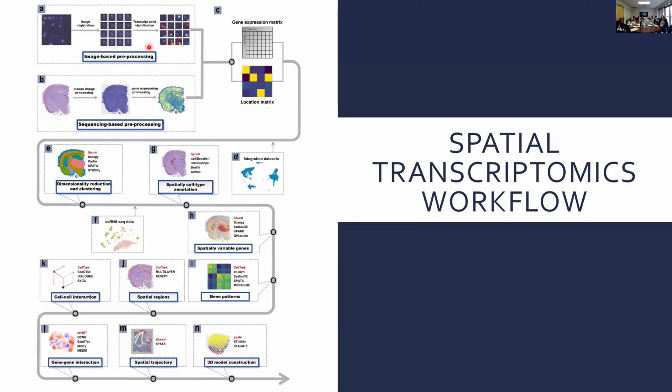This again is kind of the general overview. The endpoint for even the image-based or sequencing-based is similar to what we had before, the expression matrix, but now we also have the paired location matrix. So we also remember where on this tissue slice a cell came from.